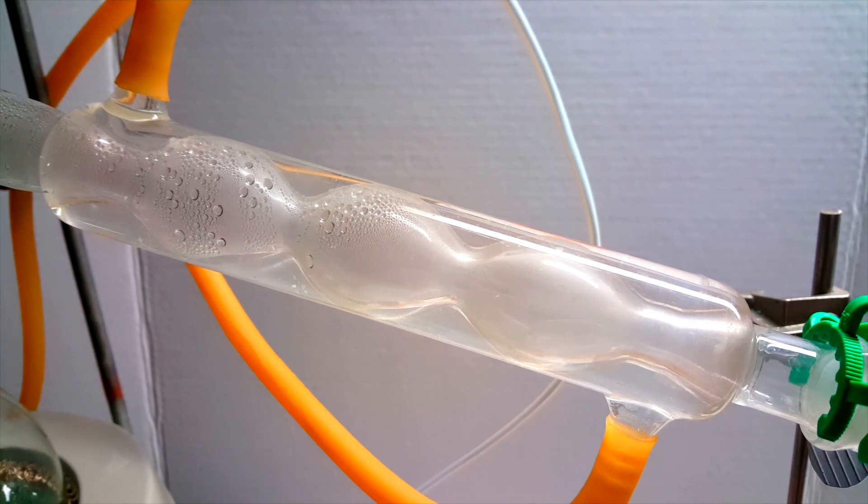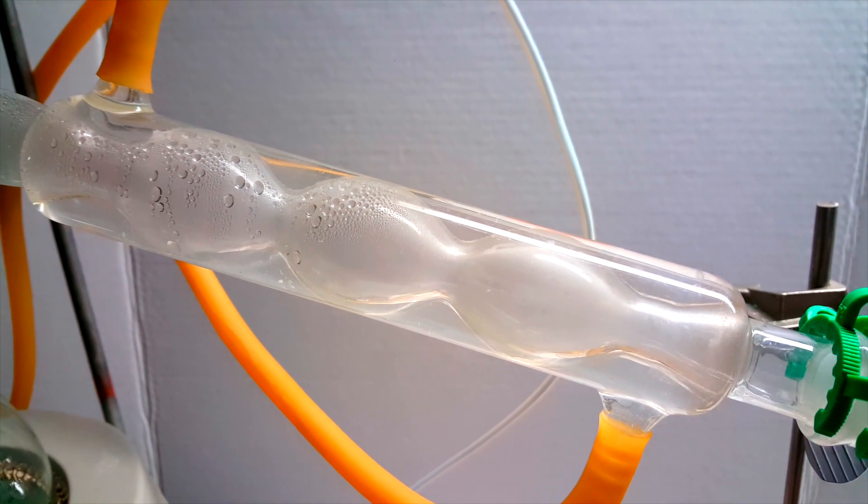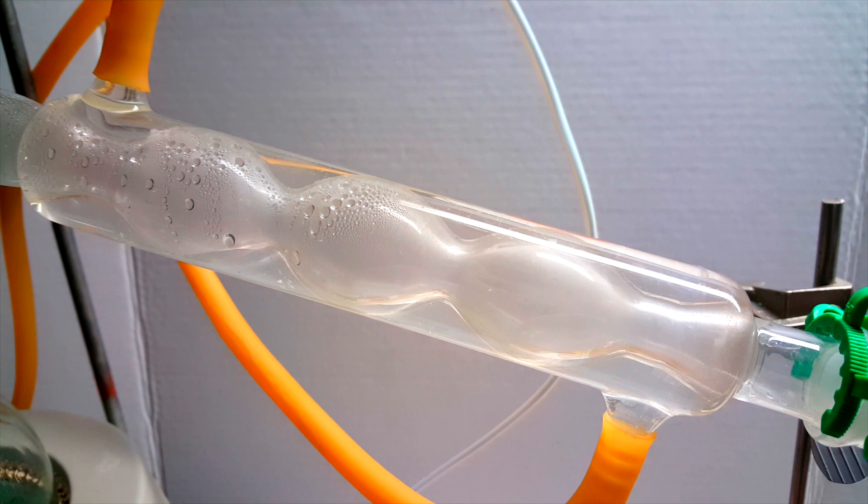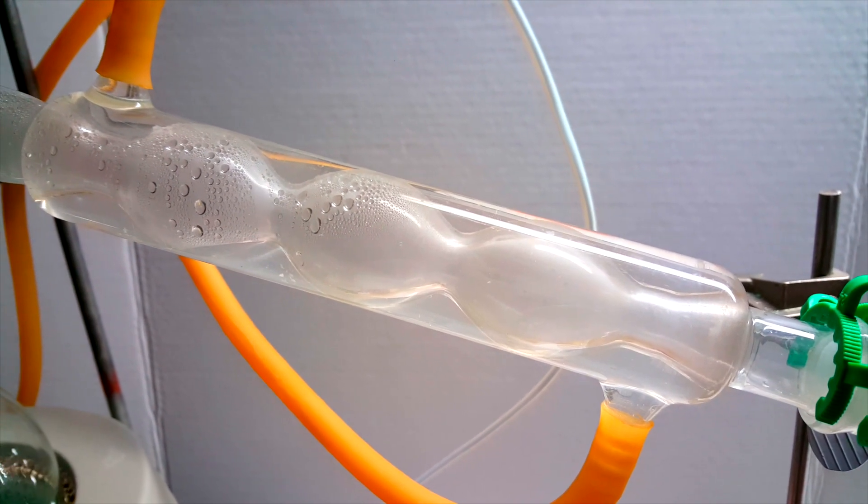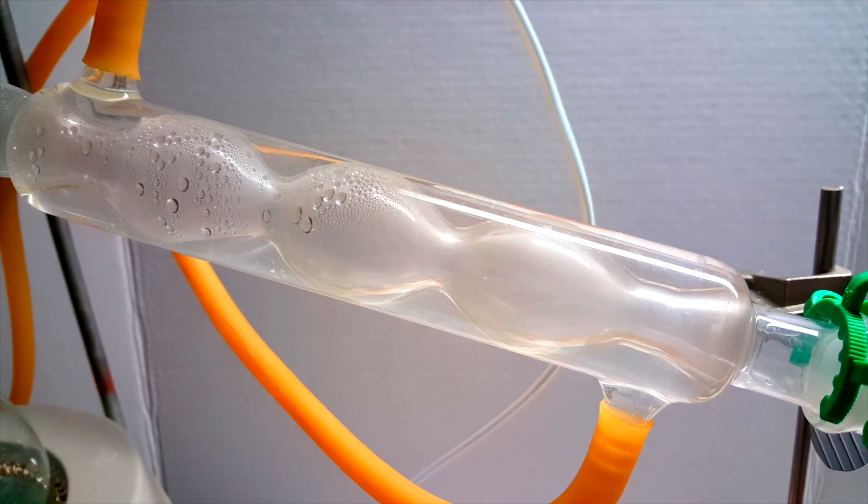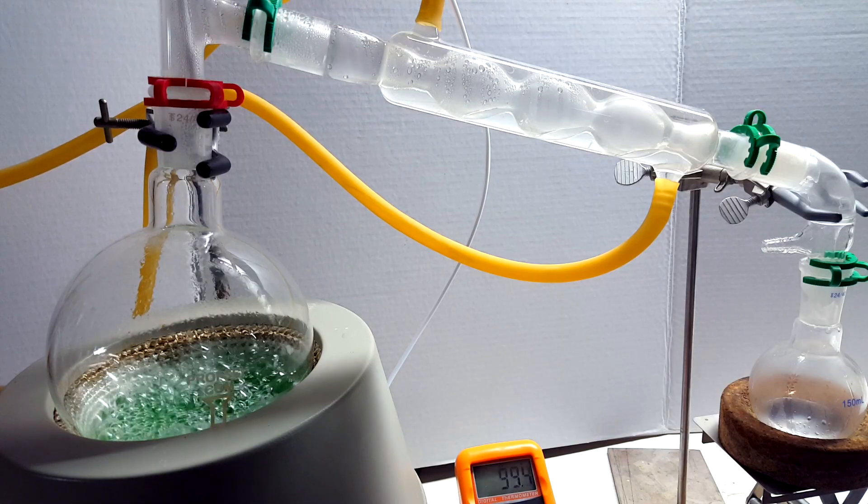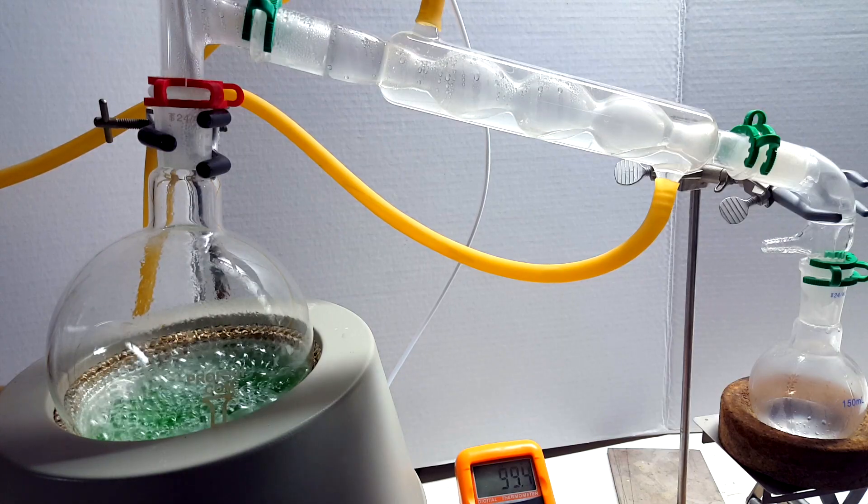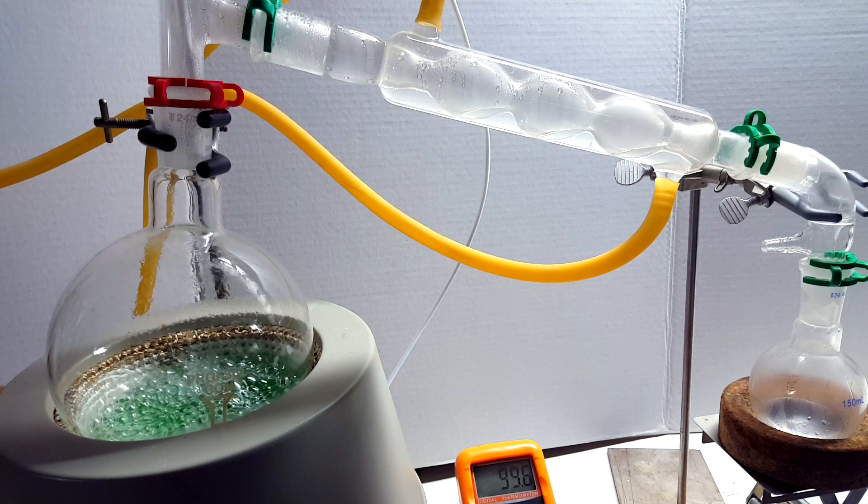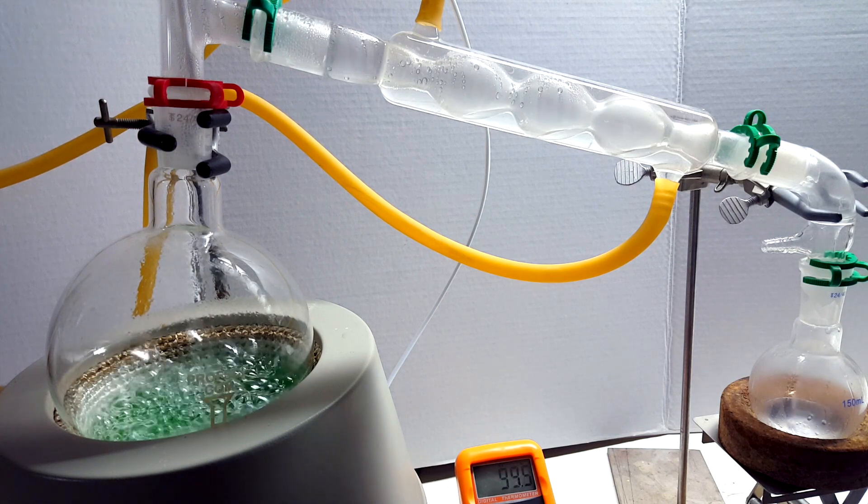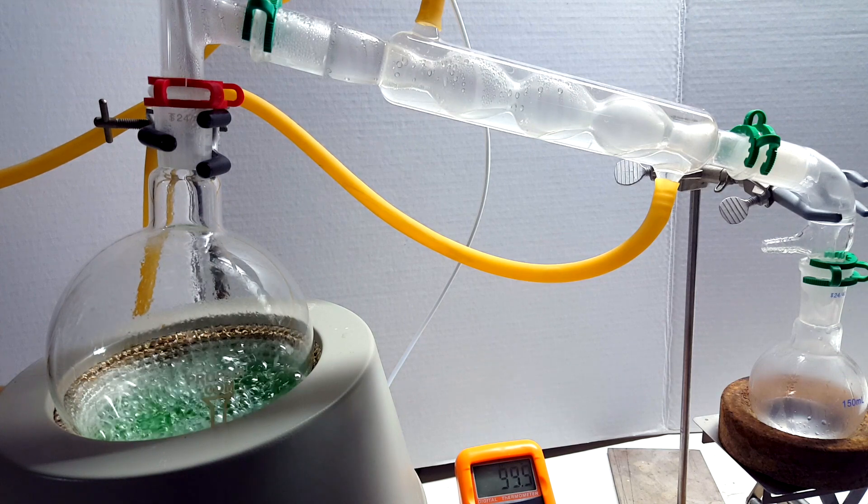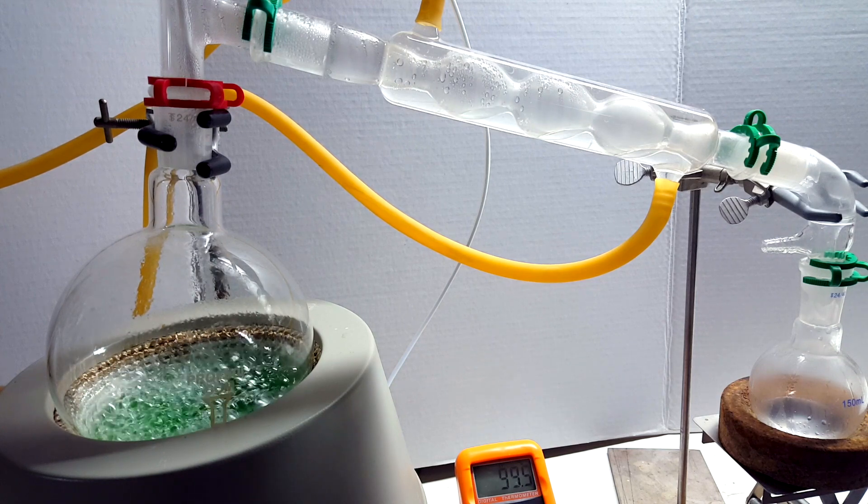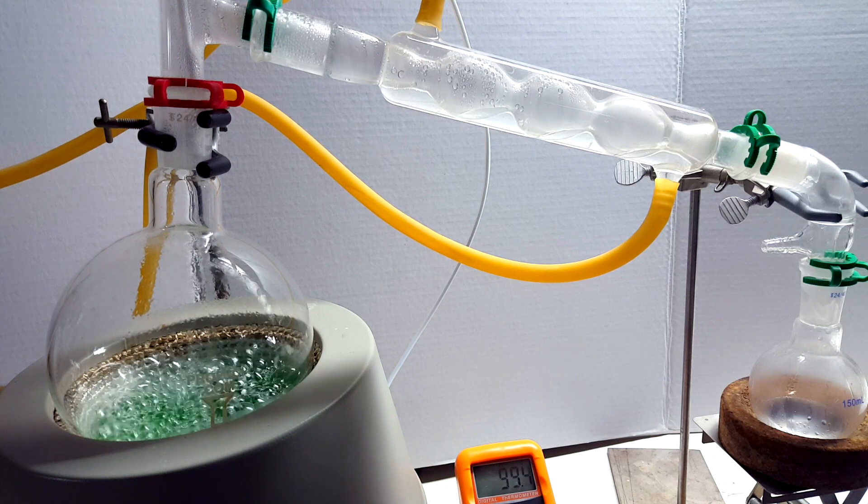As the liquid condensed, you can see that it collected slowly within each bubble. Then as the volume within the bubble exceeded the capacity, it fell down to the next, until it ultimately ends up in the receiving adapter. These first drops started coming over at about 99.5°C. The distillation continued at this temperature for quite a while, and was very well behaved as compared to last time. Obviously, the improvements I made in the methods were working much better.